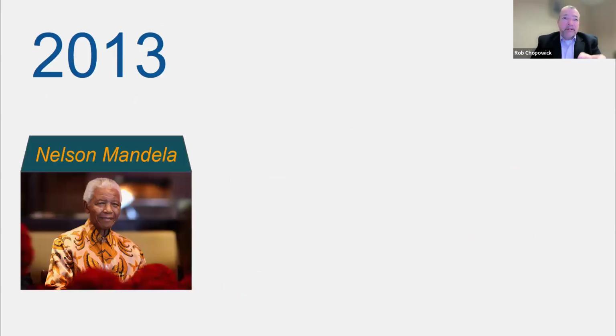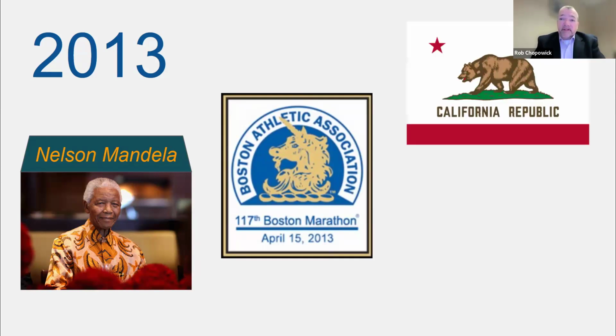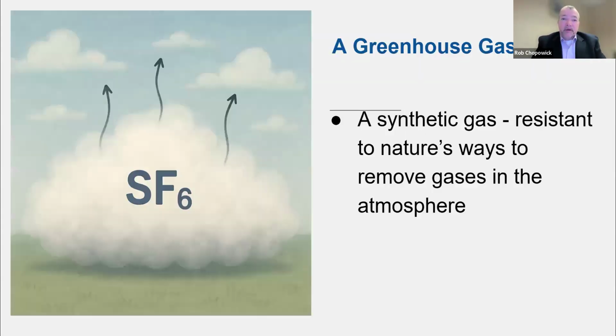This year was notable because it was the year when, unfortunately, we lost Nelson Mandela. It was also the year of the Boston Marathon bombings, a very unfortunate event, and a much less important world event, but important to the world of tracer gas testing. That was the year in which the state of California, which has been in the news quite a bit lately, banned SF6. So that changed our universe of fume hood testing, or so it seemed.